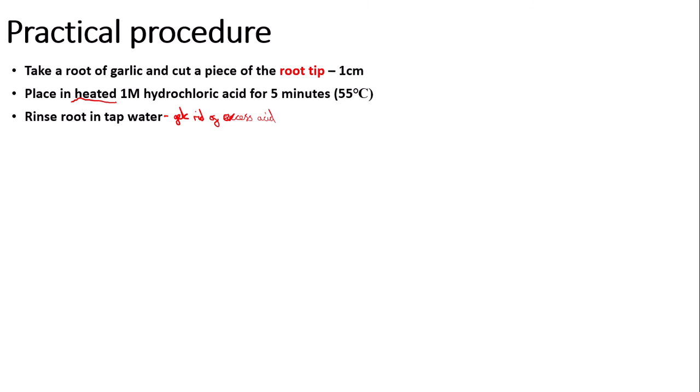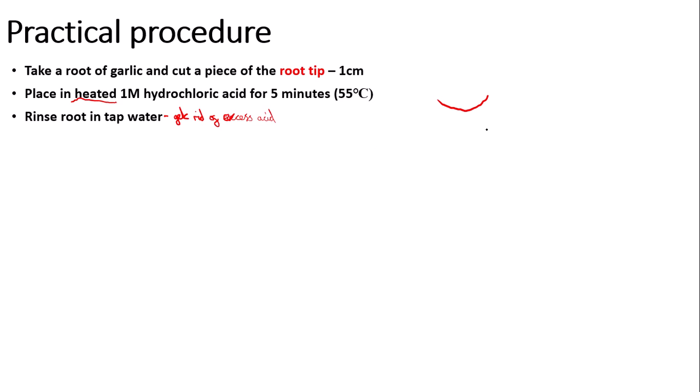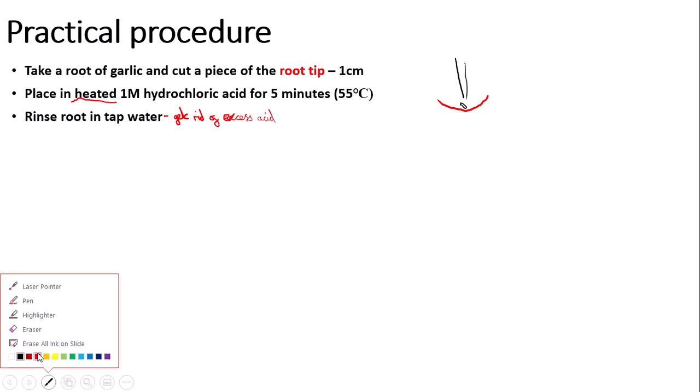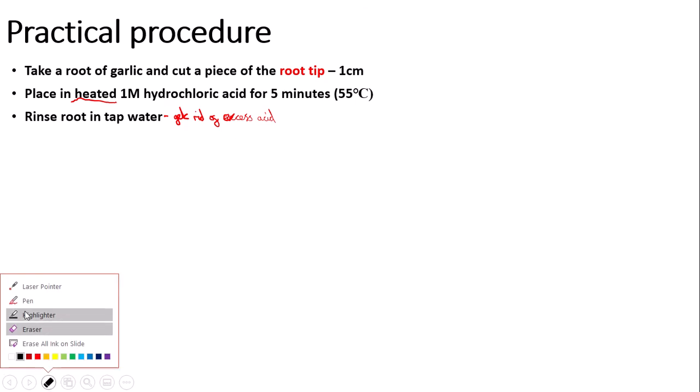And you would normally do this on a watch glass, which looks like a massive contact lens. So if you imagine this is your watch glass and you have your root tip that's been soaked in acid, you would just add a few drops of water with a pipette. Fabulous.